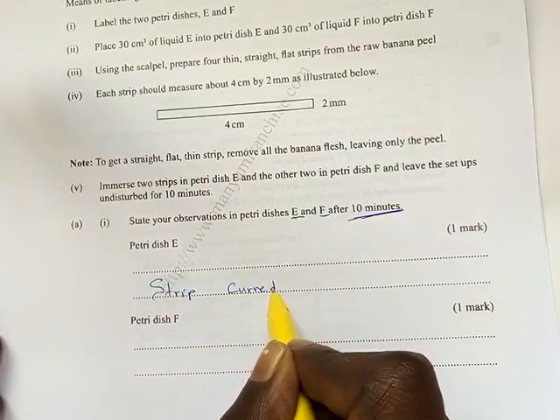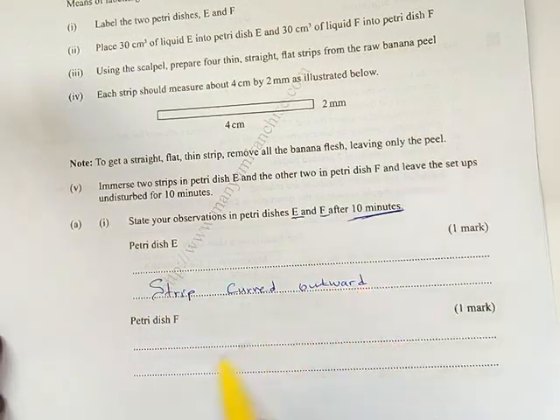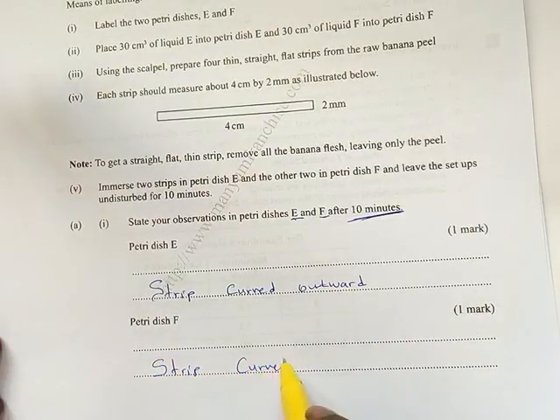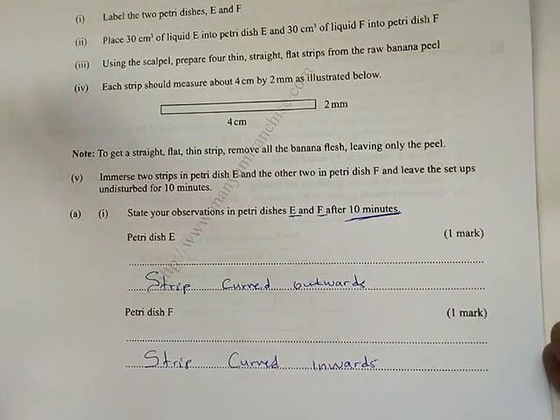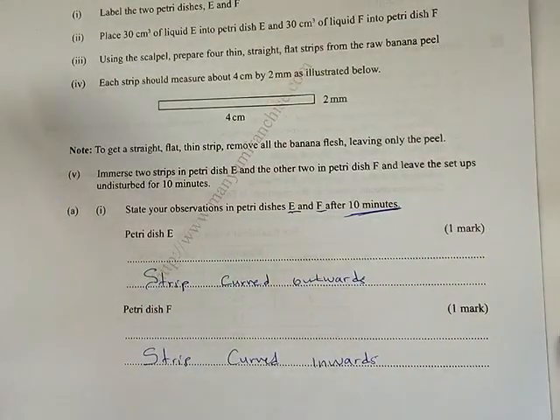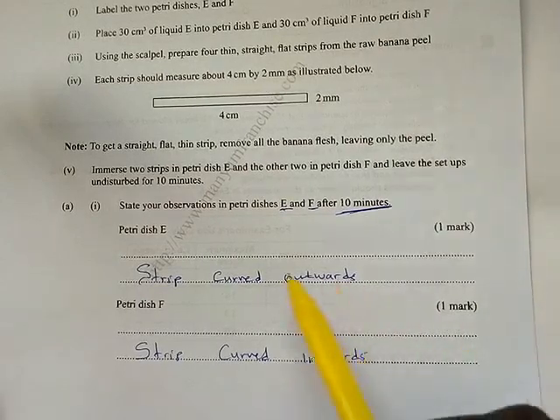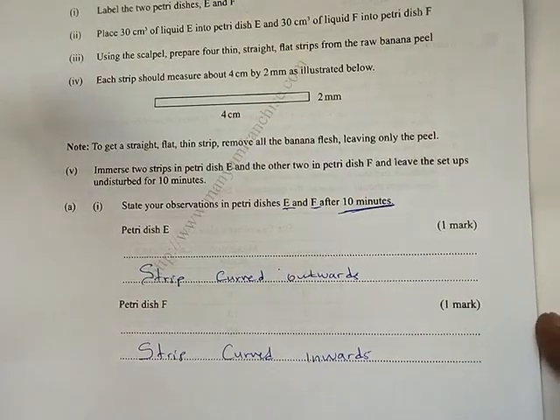curved outward, while in F, the strip curved inward. Now up to now you should be able to know the nature from the observation. Petri dish E is a hypotonic solution because the strip in E gains water, while in F it loses water and becomes flaccid.